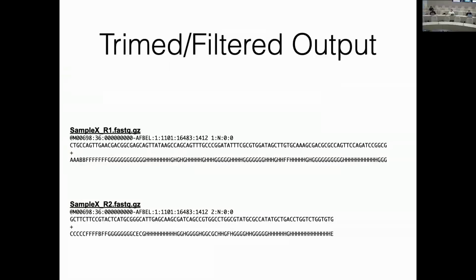Is 40 usually the cutoff? It depends on the application. 40 is still a pretty good length. I think one of the software packages that I use has a default of 35 or 32 or something like that.